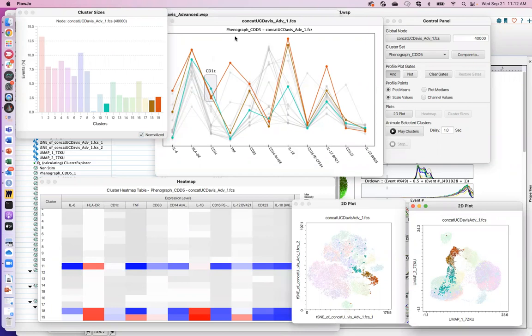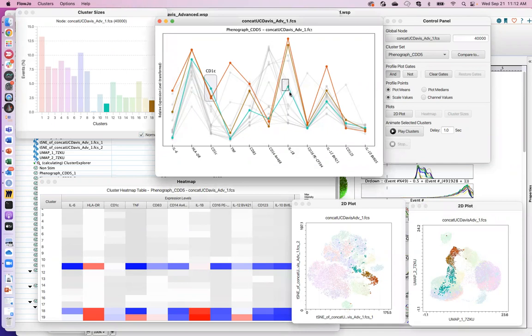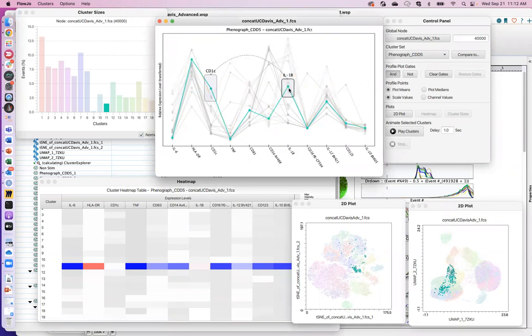Okay, you can further filter your markers here if you want by creating a second gate. So for example, maybe you want to go after that mid-expressor, right? So here's a dendritic cell that is mid-expressing for IL-1. Right, we've identified that as cluster number 11. Okay, and again, it back maps that onto your t-SNE or your UMAP plot.